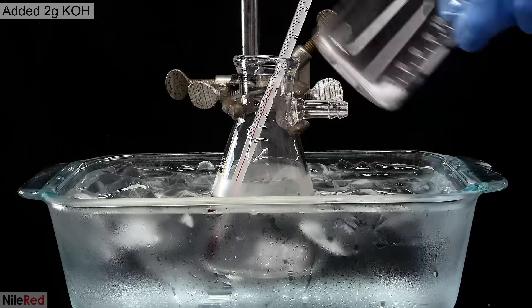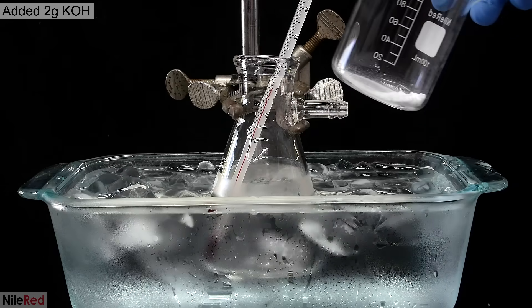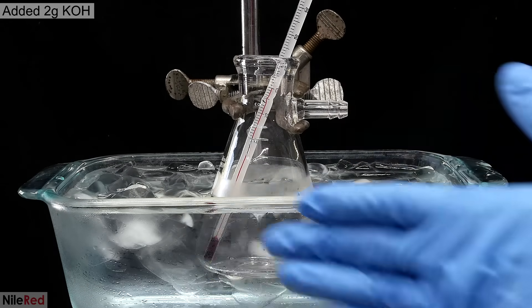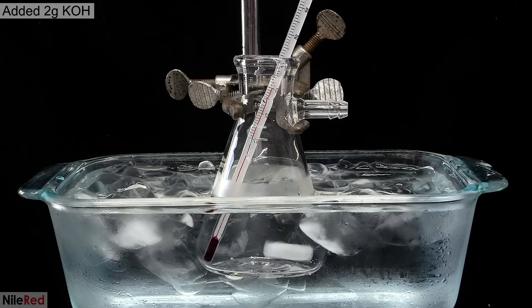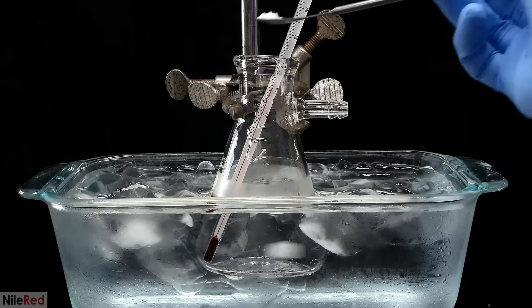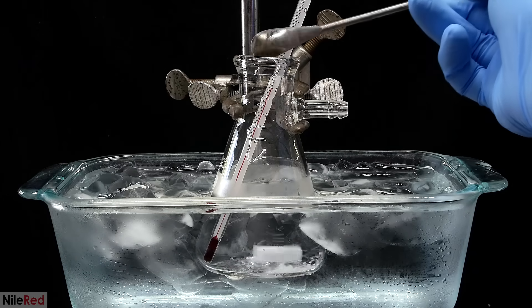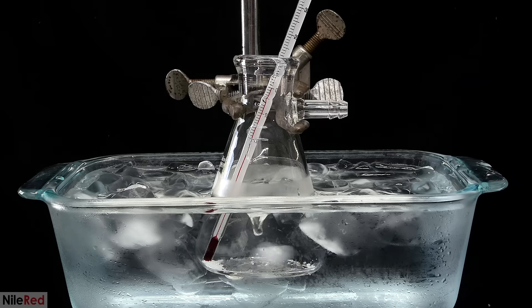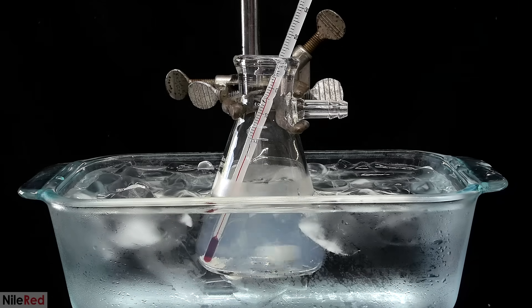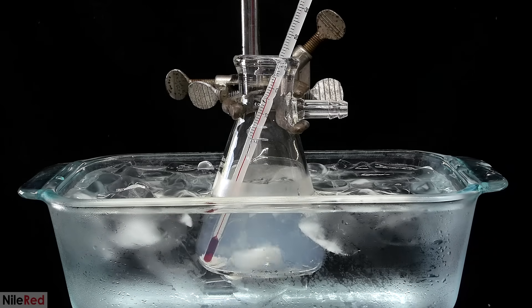A few minutes later, it's back to around 0°C, and now it's time to add 2 grams of crushed potassium hydroxide. It's important to add it in small amounts because with each addition, the temperature is gonna rise. In some of the additions, the temperature spiked to around 8°C, but I never let it go higher than that.